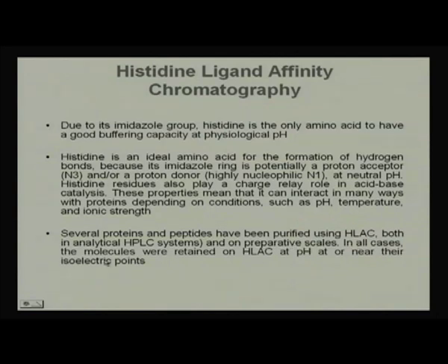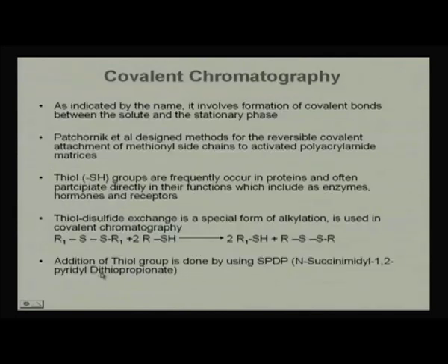In all cases, the molecules were retained on this histidine ligand at pH near to their isoelectric point. Now, these are some of these particular biological molecules.